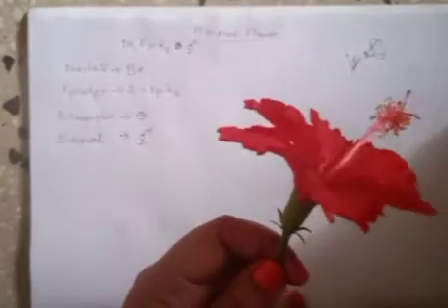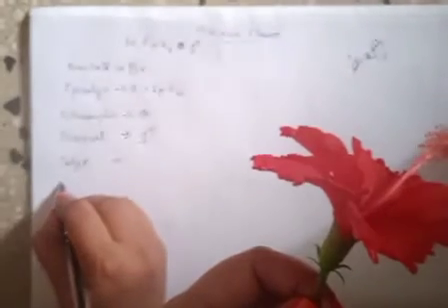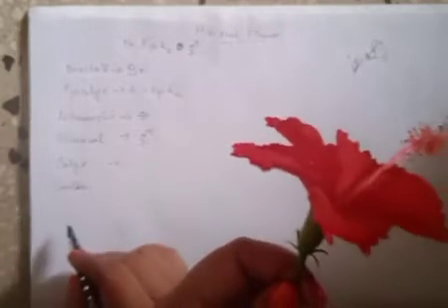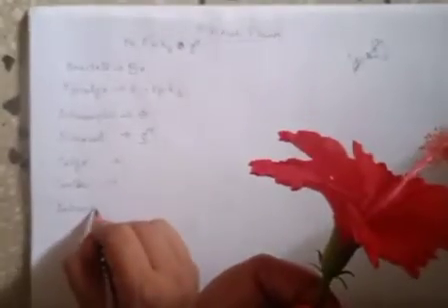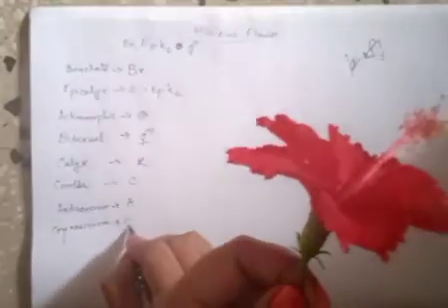And then after that, what do we have? We can say about the calyx which is present, the corolla which is present, and then after that, I will talk about the androecium and gynoecium. Okay, so calyx is represented by K, corolla C, androecium A, and gynoecium G.